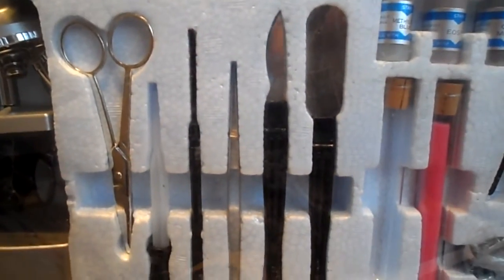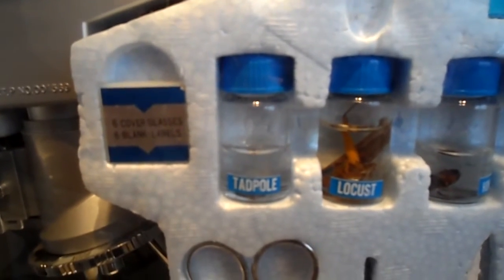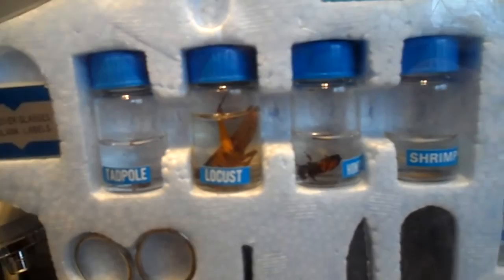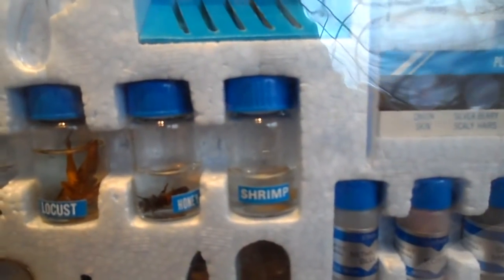It is obviously for older children because there are a lot of sharp things in there. But you do have some other unusual items in here: a jar with a tadpole in, a complete real locust, a honey bee, and a shrimp or prawn.